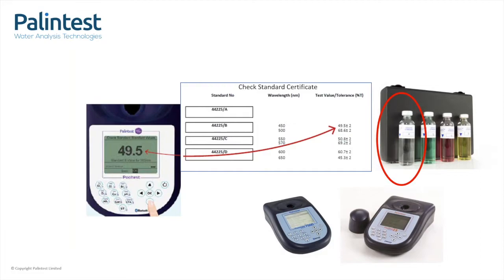will need three coloured standards and a blank to check all six wavelengths. The blank is this clear, colourless solution, usually labelled standard A, and the instrument uses this as its reference of what 100% transmission is. The certificate that is supplied with a set of check standards tells you which standard to use for each wavelength and the value that it should read.